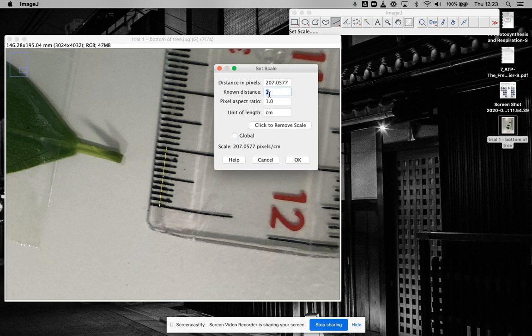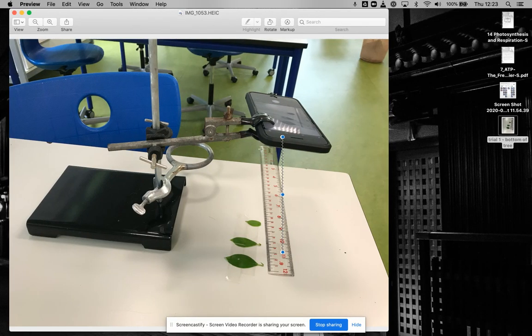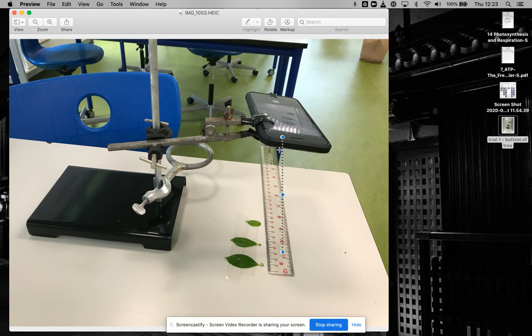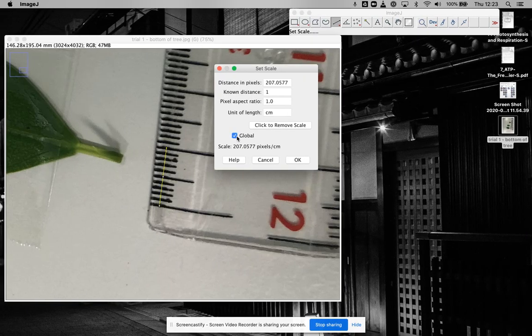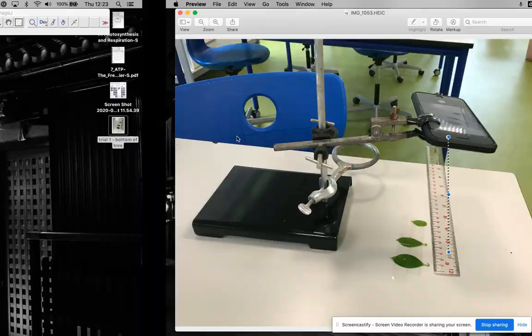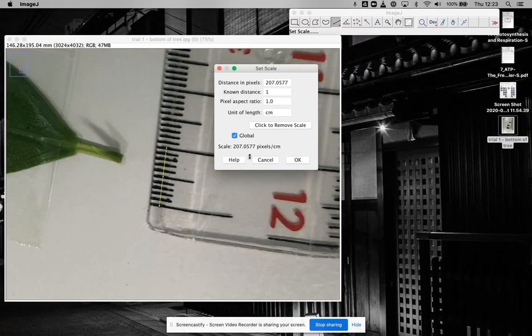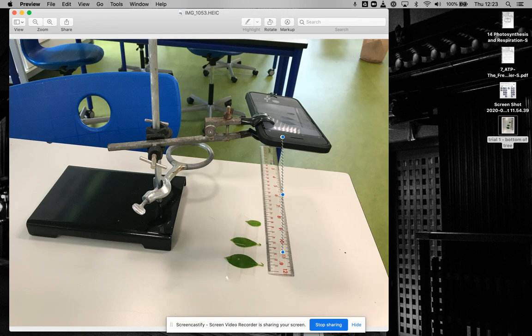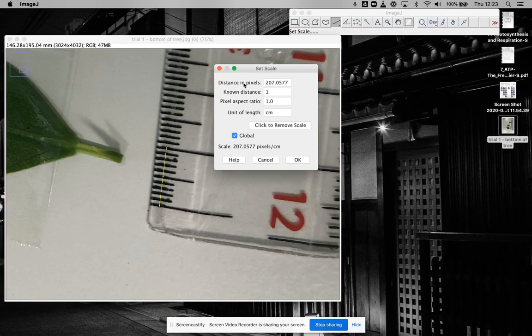I'll set that to centimeters, and then I'm going to click global here. Because as long as you keep this setup exactly like it is, any picture you take using this, you can use this measurement. If you end up changing this, or changing the camera, or anything like that, then for every picture you're going to have to do this again.